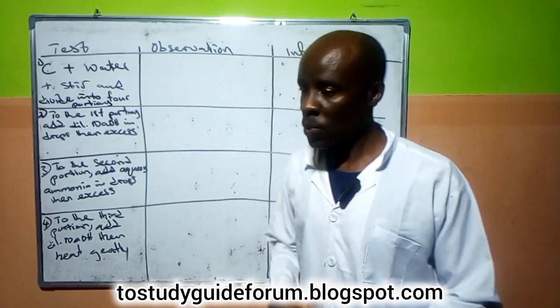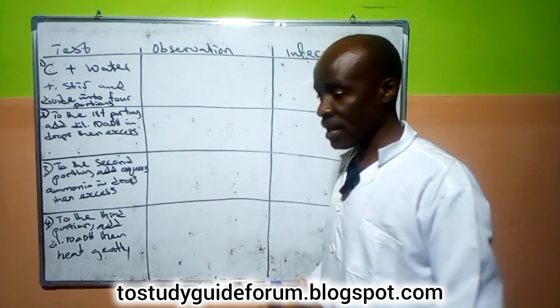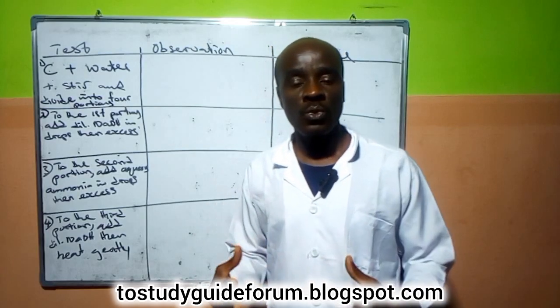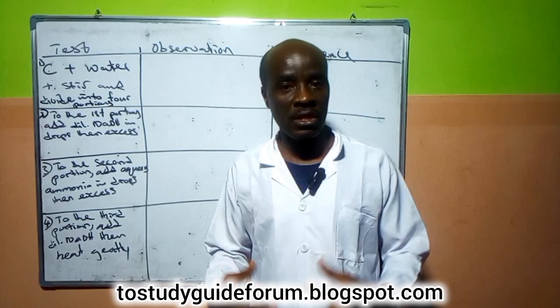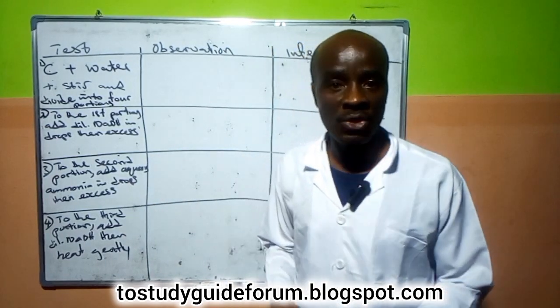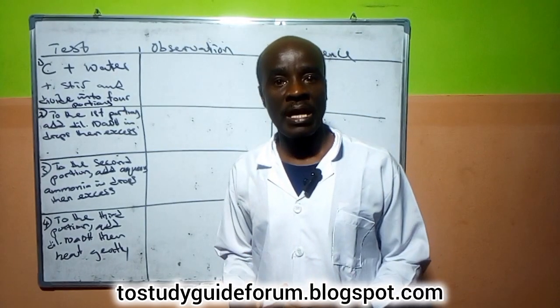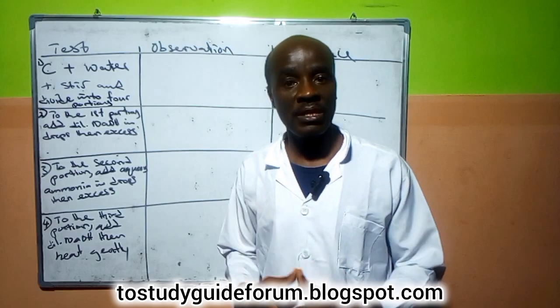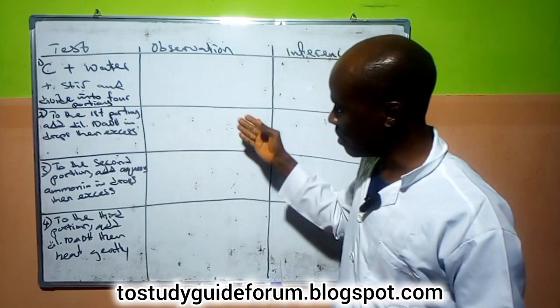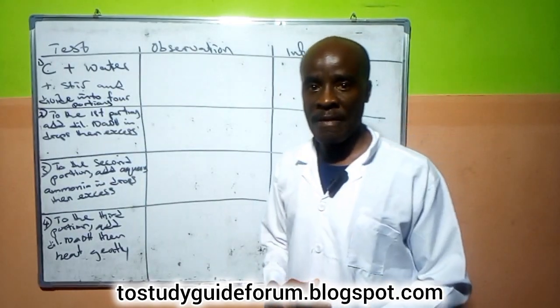So the question we have here, I'm going to analyze it. At the end of this analysis, I will give you the name of the two compounds, because at this time, what they want students to analyze is a mixture of two salts. The two compounds, one is organic and the other one is inorganic. So mixing it together, we are going to analyze to find out the ions that are present in them, and that's the test that I believe we're going to be working with in order to identify this thing.